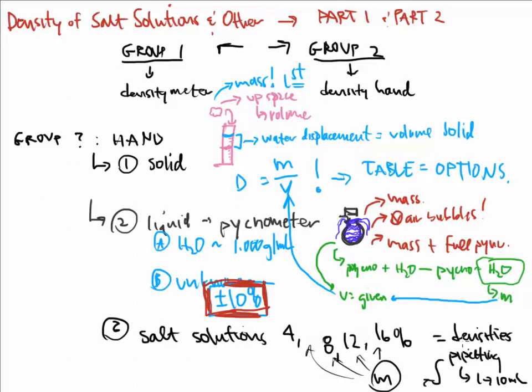So I told you that to do these densities, you will pipette these into an empty, tared container, and you will get the weight of whatever volume you decide to dispense. I also said the lab procedure probably tells you to use a graduated cylinder. So do not use a graduated cylinder, please. No, no, no to the graduated cylinder at this point. That is not what we want.